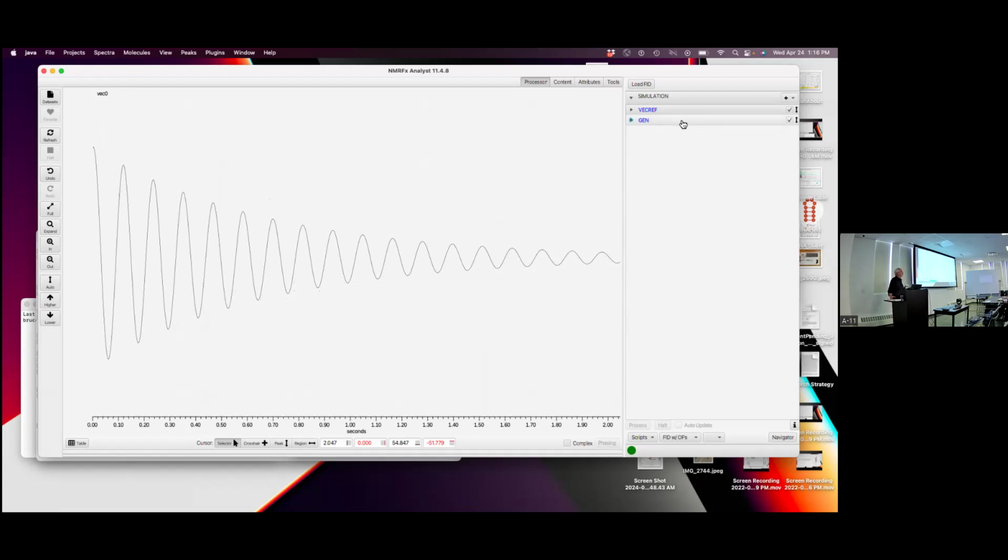If you were processing an NMR data set, what's the first thing that you might do? In a series of operations. Correct the phase.